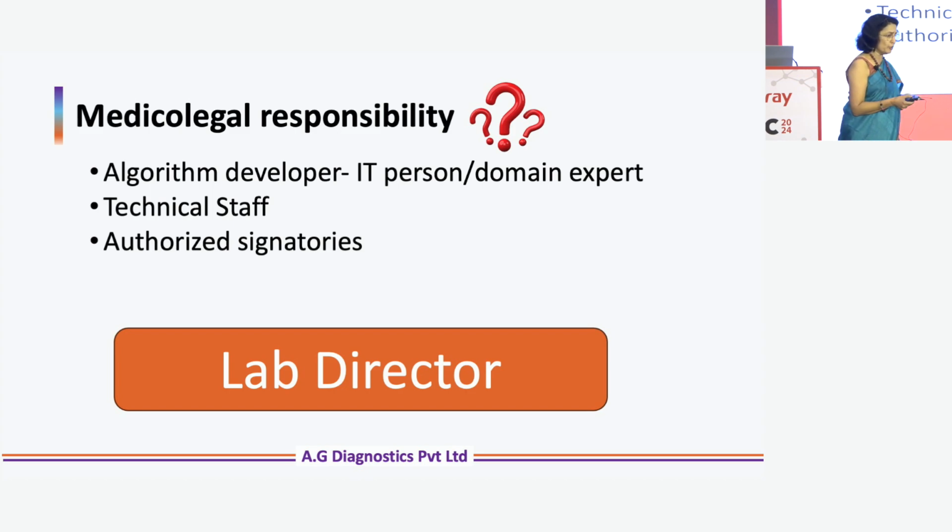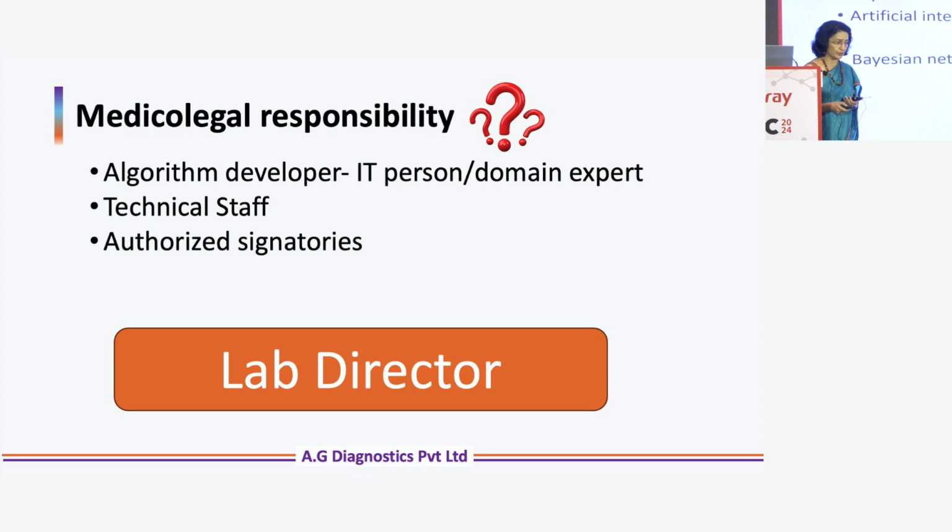Another important thing, with whom will the medico-legal responsibility lie? Will it lie with the algorithm developer who might be an IT person, the domain expert who has given him all the inputs, the technical staff, the authorized signatory, who? Yeah, so at the moment the vicarious responsibility lies with every lab director, but this is still a question which may come up in the near future as a very pertinent question.